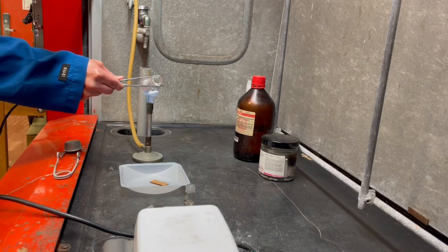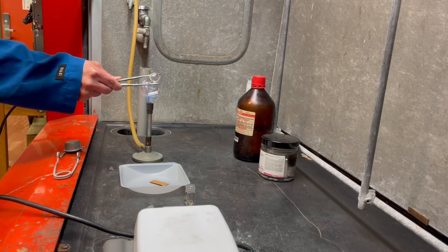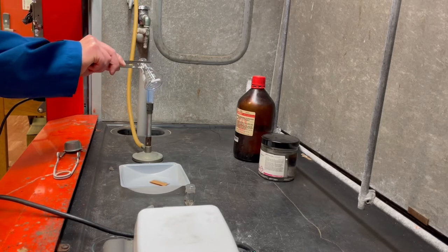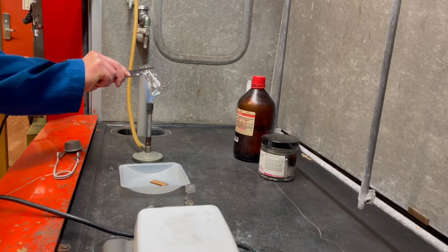So that's all I'm doing. Typically in, let's say, a research lab, what you would do is put most of this glassware in the oven. You've got to plan ahead. I mean, we're grown-ups now, right? You've got to plan ahead.